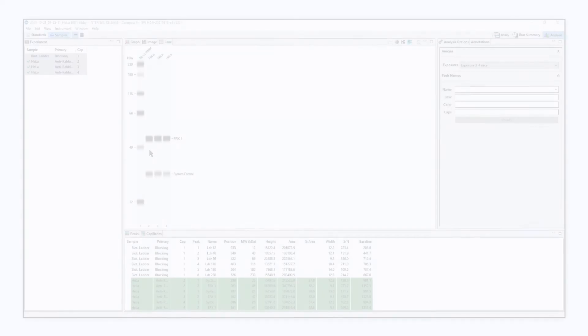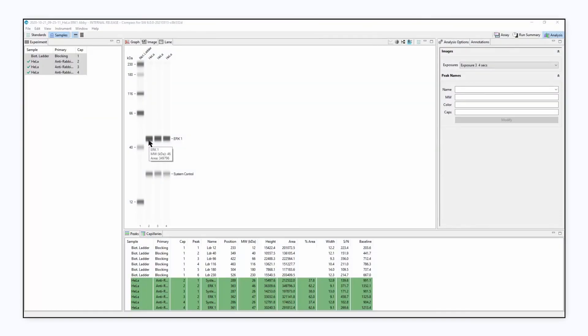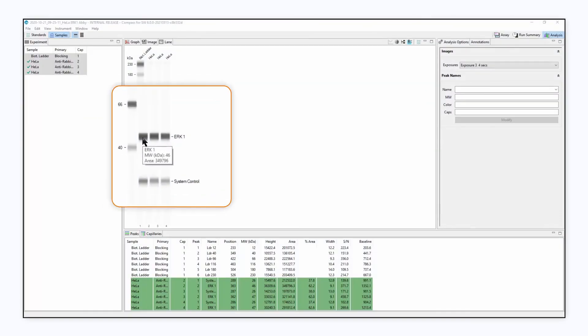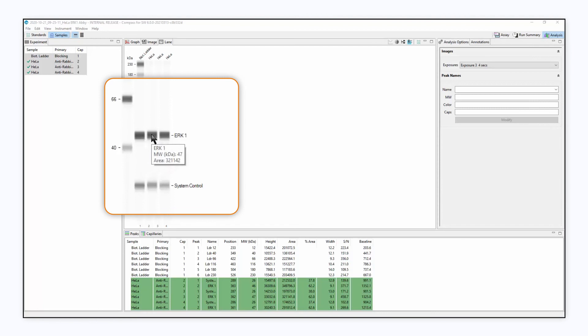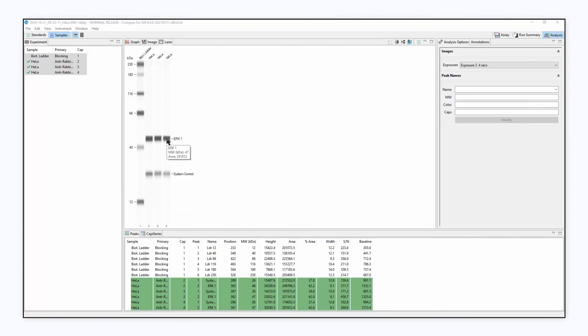Want to identify whether a protein is present or absent? Abby gives you the qualitative Western data you are used to seeing.